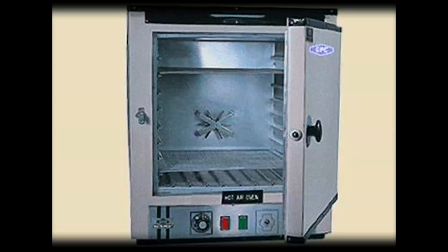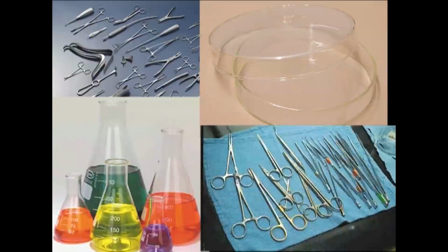But it has certain limitations, because such high temperatures might not be tolerable by other materials like growth media, which cannot be sterilized in a hot air oven. Precisely, the things that can be sterilized in a hot air oven should be dry in nature, like glassware, surgical instruments, petri dishes and conical flasks.